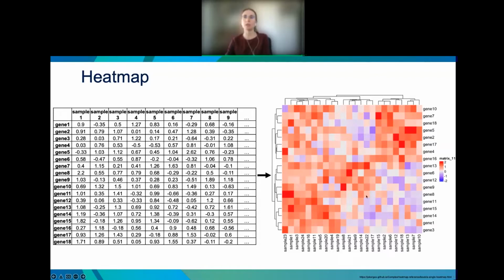And we can create a heat map like this where each of the range of values is mapped onto a color bar here from -2 to +2. And each little box in the heat map corresponds to that area on the color bar, wherever that number is.